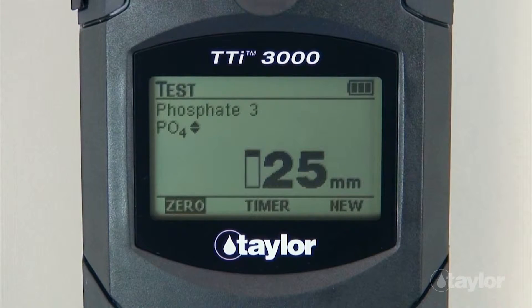Select a chemical form — phosphate, phosphorus, or diphosphorus pentoxide — for expression of test results using the scroll arrows. For this demonstration, we will select Phosphate.